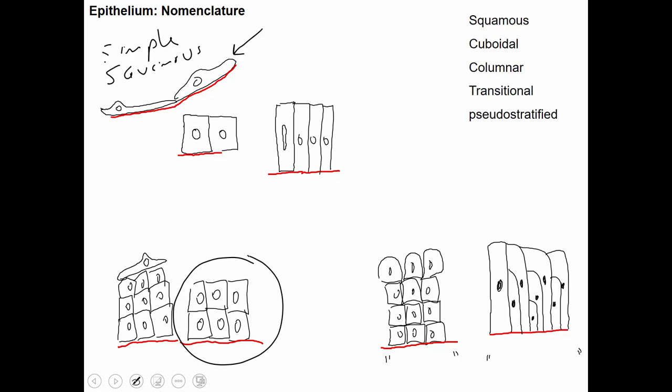What about next to it? What type of epithelium is that? Why is it stratified squamous? Name from the apical cell. And so how do you know that this is the lumen out here then? Because the basement membrane gave directionality, right? Something is going to give you information. And so that means these are the basal cells. It's stratified, but the nomenclature is based on the most apical cell. So it's stratified squamous epithelium.